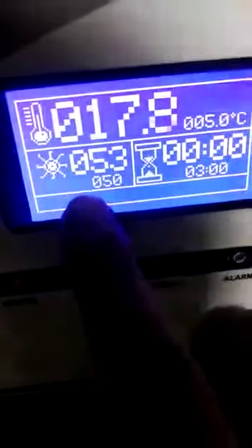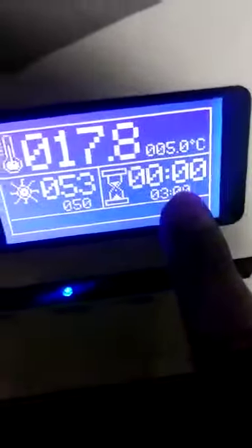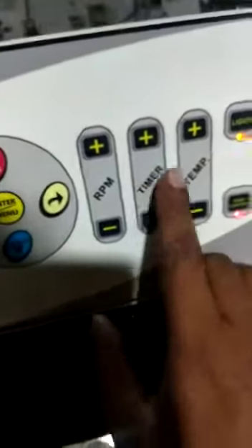This is the temperature of the water. This is the timer. Set the button to use the timer.